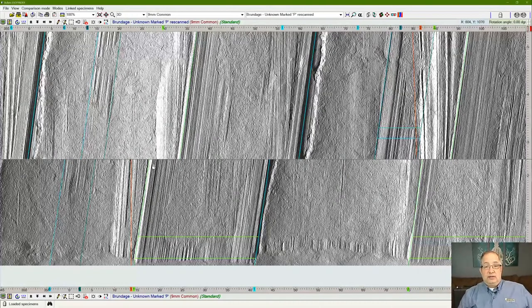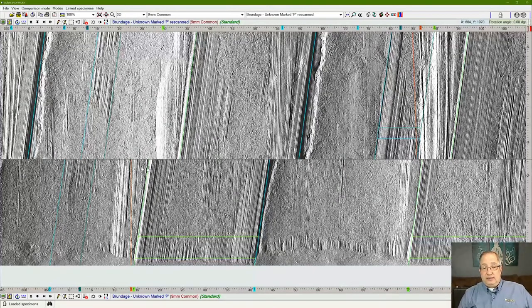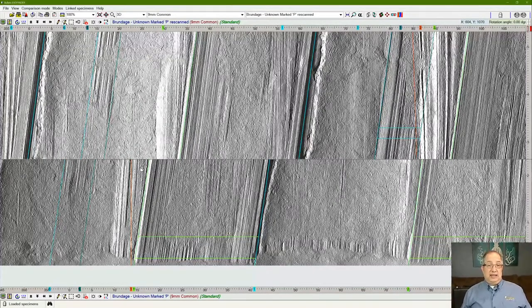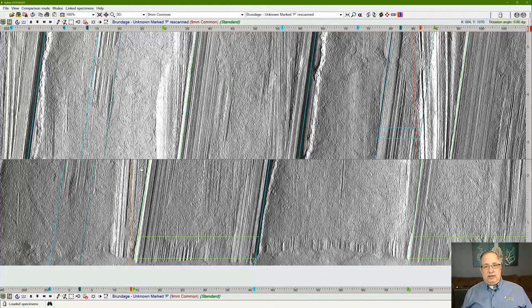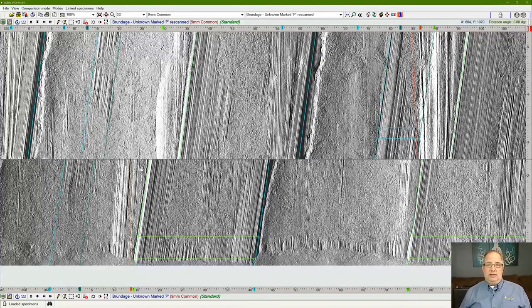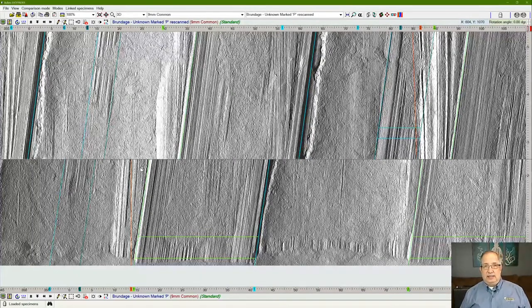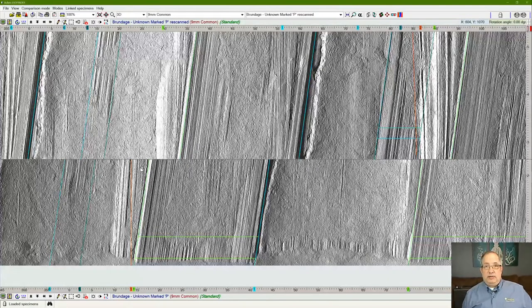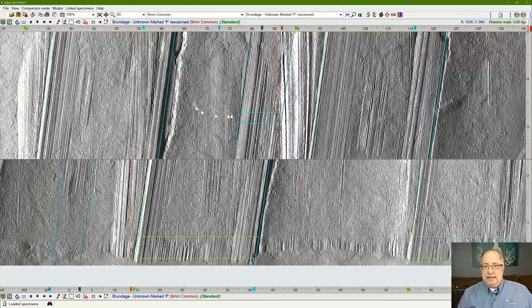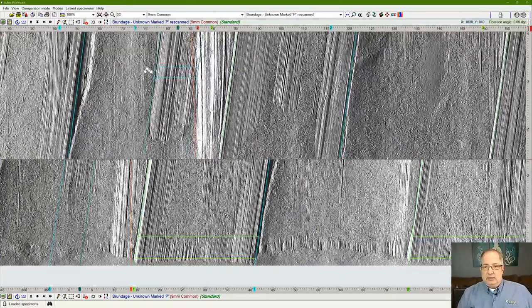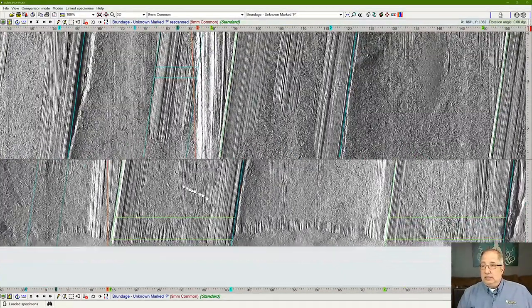The EvoFinder is also a highly configurable system so you can have as simple as a single scanning system or you can network your laboratory or region so you can have it all connected together to provide access to this information to everybody else within the system.